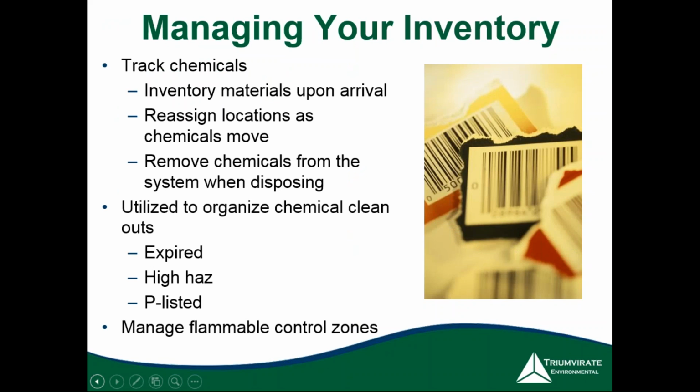So again, managing your inventory, you want to track chemicals, inventorying materials upon arrival. This is a crucial point: the more chemicals you get into the inventory as they come in, the more accurate your chemical inventory is going to be. Reassigning locations as chemicals move throughout your facility can be pretty important.